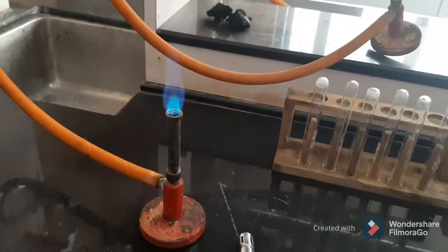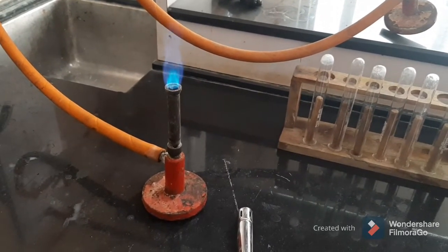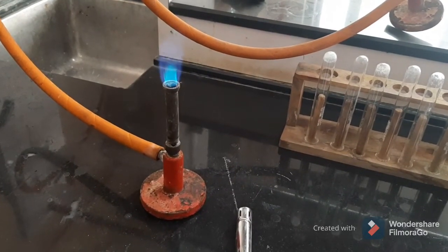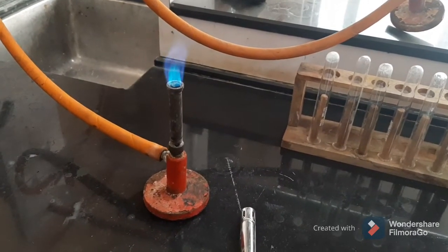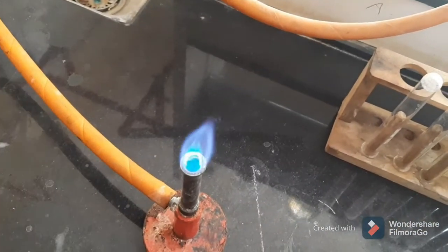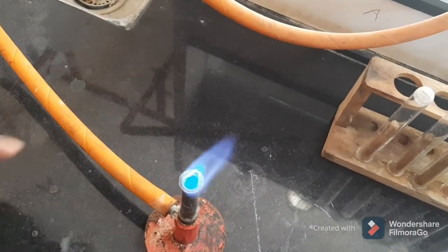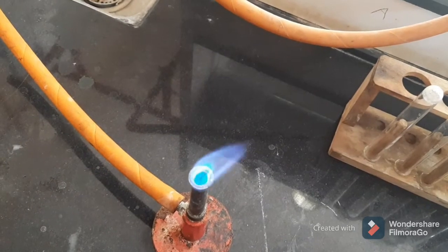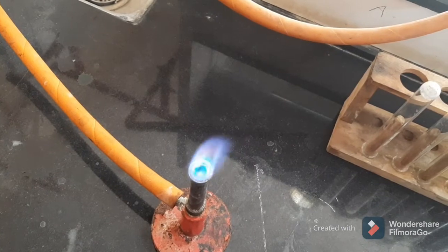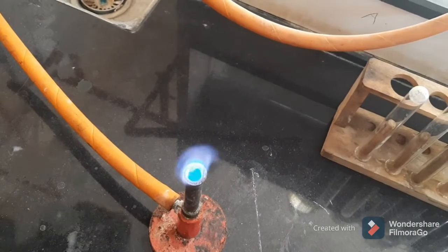For regular practicals we use the blue flame, which is produced in the presence of oxygen. For adjusting the flame we use the bore at the base of the Bunsen burner. There are two zones: the inner zone (darker blue) and the outer zone (light blue). The outer zone is the hottest zone, while the inner zone is the coldest zone.